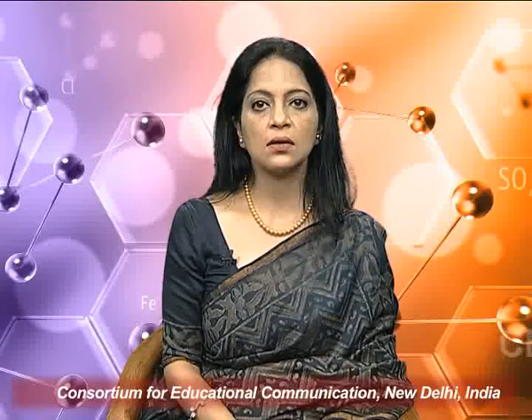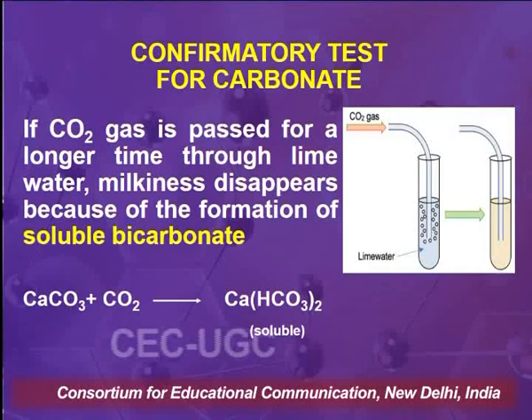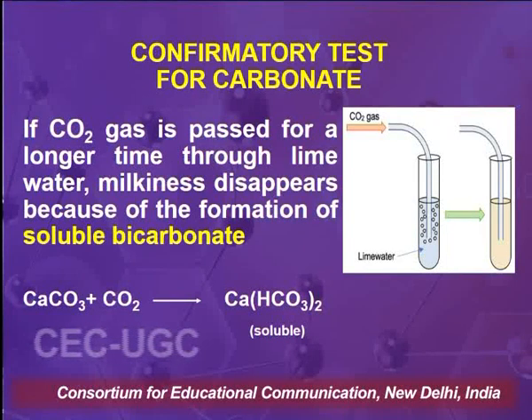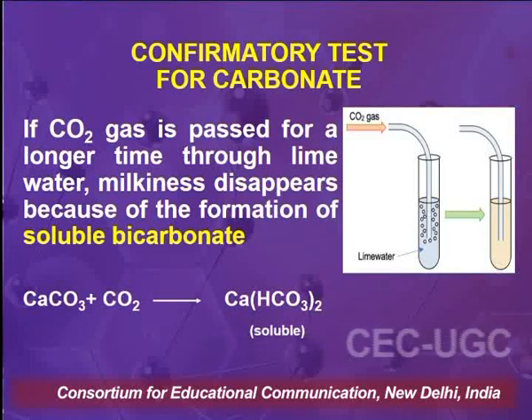This is the way, as the picture shows, wherein the bubbles or effervescence is seen in the test tube and the gas being evolved, that is carbon dioxide gas, on passing through lime water turns the lime water milky due to the formation of calcium carbonate.